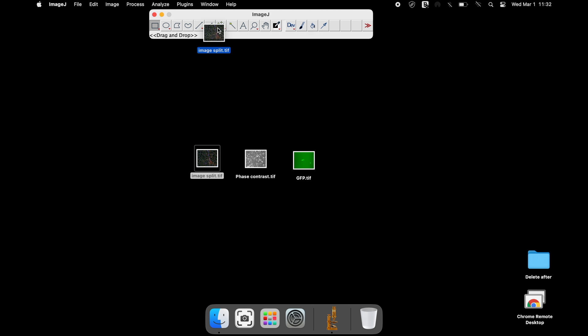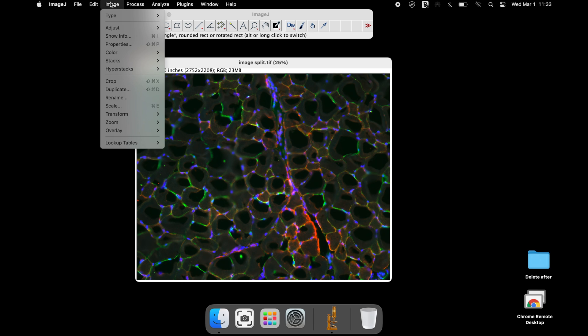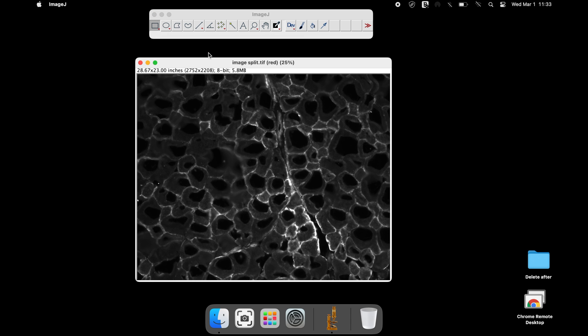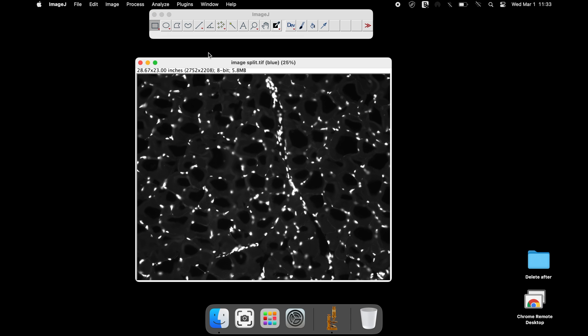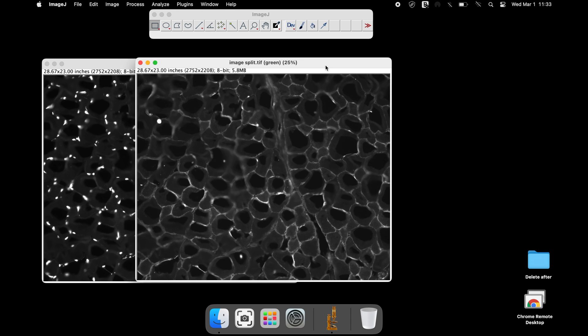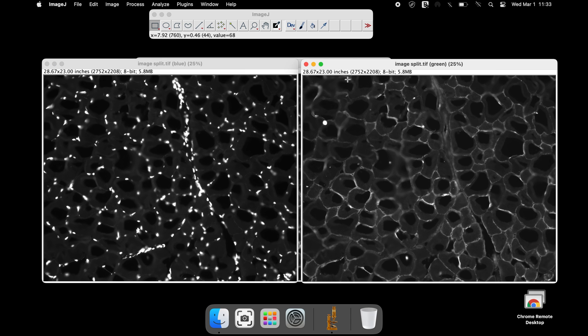To split the channel colors of an image, open the image in the ImageJ software. In the ImageJ toolbar, click on Image, Color, and Split Channels. At this time, the image has been split into three different channels.